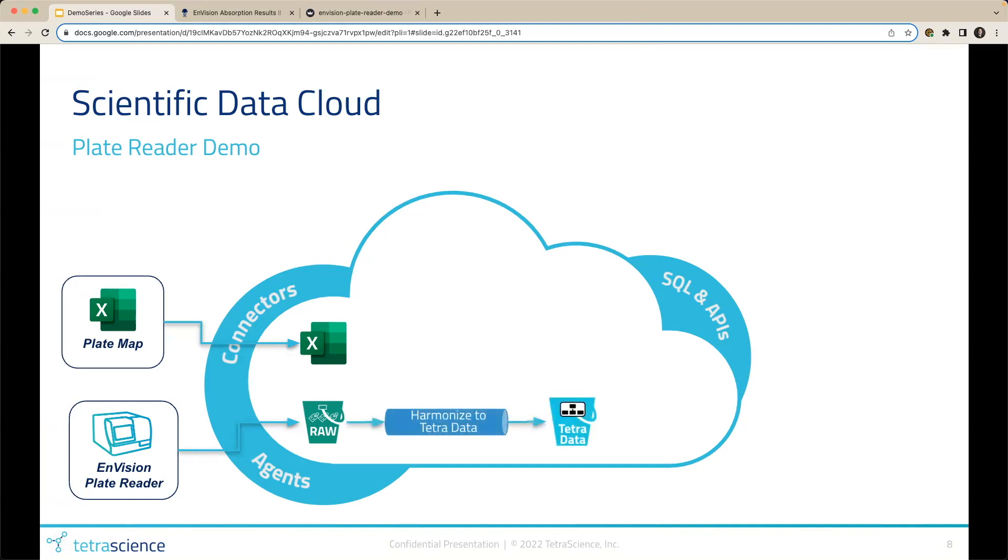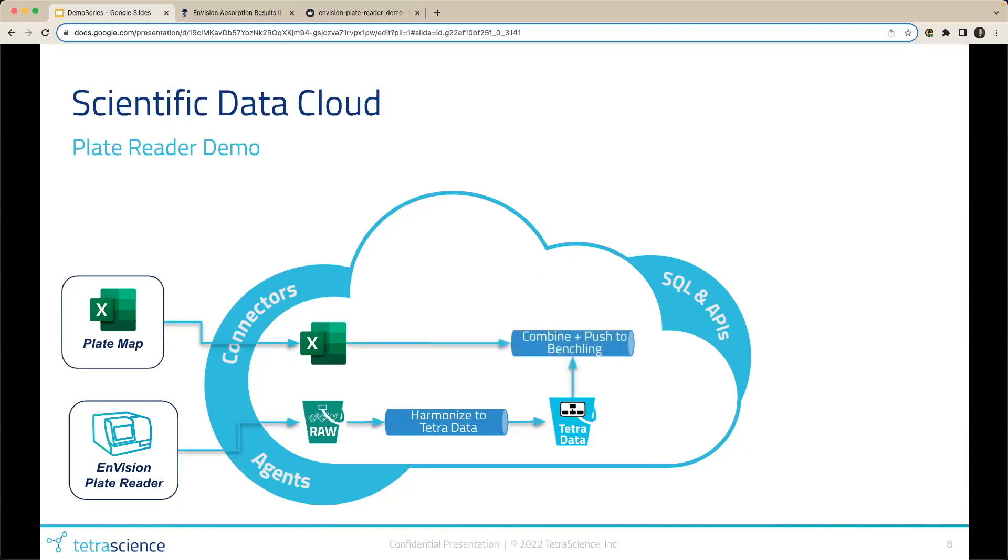Because once that raw data lands on the platform, a pipeline is triggered to produce Tetra data. Tetra data enables interoperability and reuse of the data by harmonizing the data and exposing the data via API and SQL. For this particular use case, once the Tetra data is produced, it's automatically associated with the well locations from the plate map. Scientists no longer have to spend time manually copy and pasting the instrument results to the plate map or their ELN, which also introduces human error.